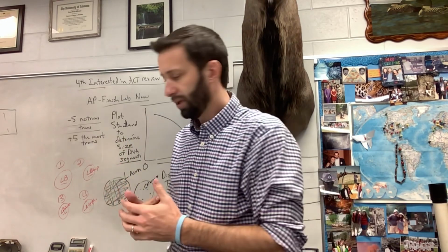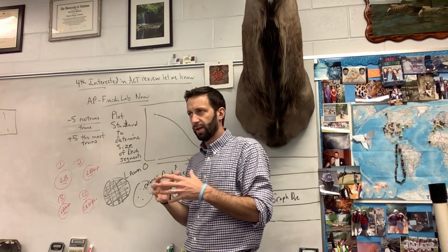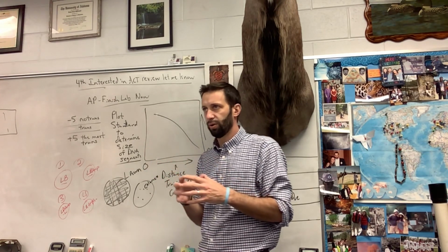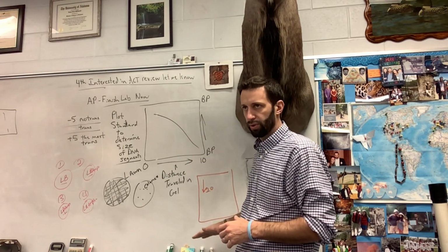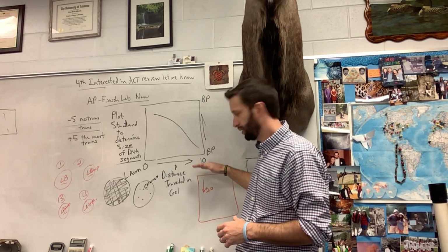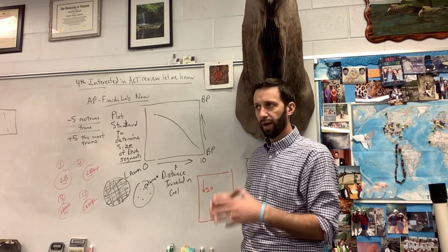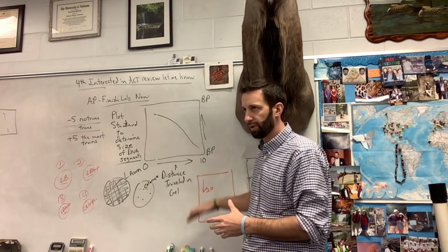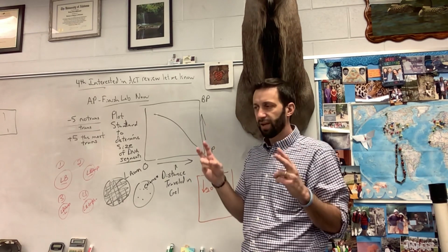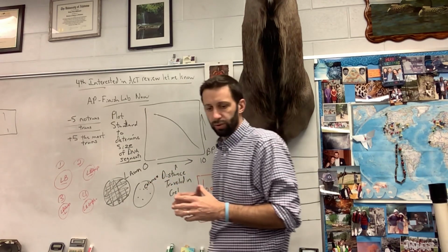But basically what we're doing today on the graph is, you've got a set of DNA, which is your standard, okay? So keep in mind, when you put DNA in a gel, it's going to run through the gel. And the longer you leave the electricity on, the more it's gonna run through the gel, right? So in order to figure out how big the DNA is that you have in the gel that's moving through there, you have to have something to compare it to. So the standard is like the known comparison, okay? So that's the one that you're graphing on here.